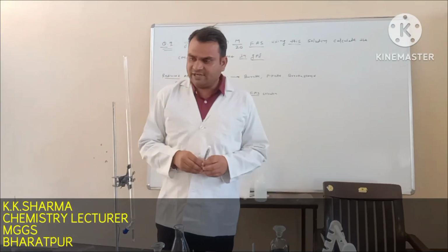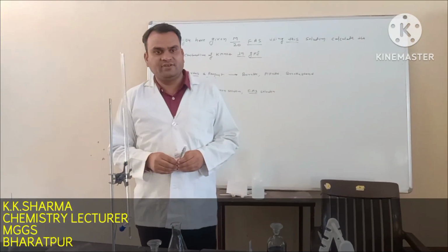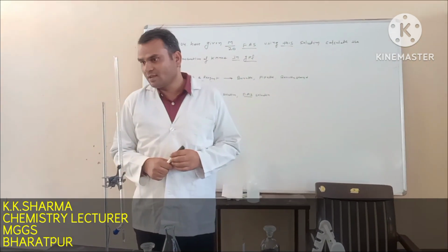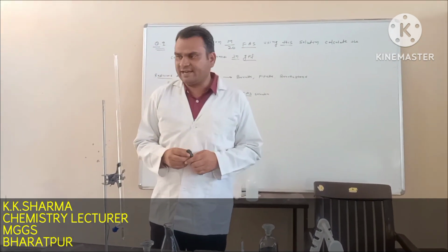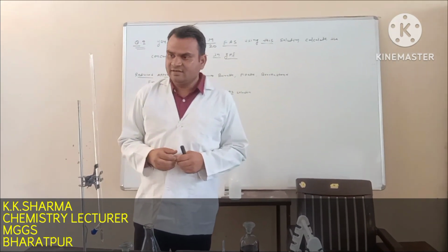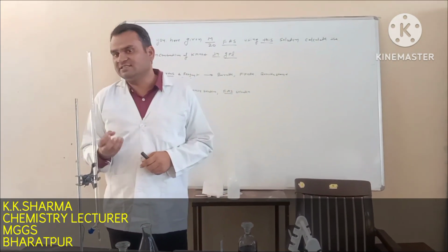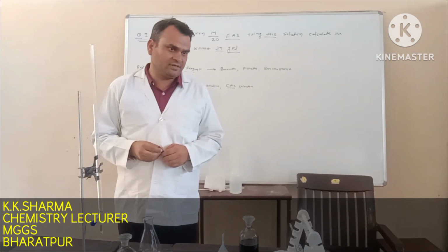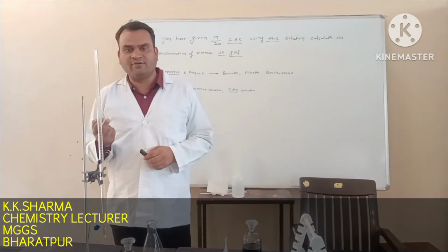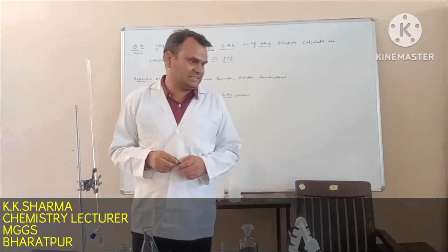Good afternoon, students. Today we are going to start the titration exercise. What do you mean by titration? Titration is a volumetric analysis in which we calculate the concentration of an unknown solution by using a known solution. In titration, you are given two types of solutions in exams.